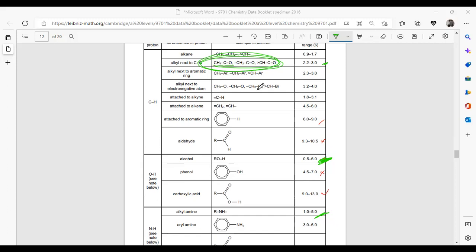If that's the case, we have two more peaks here, for some other carbon atoms. I'm not sure which carbon atom, but it has a corresponding carbon with one hydrogen atom, and one hydrogen atom we already have.